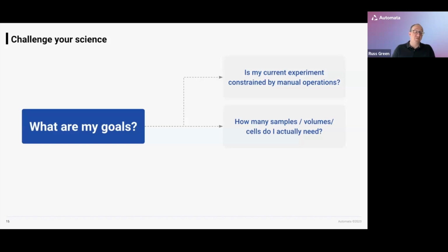In fact, I've seen this more than once, where we've gotten to the question about, okay, we're culturing cells in a certain size of flask. How many cells do we get from that? And the answer will be a couple of million cells. And then we'll get into the question about what we need in terms of numbers of cells to actually achieve the outcome. And it might be in the order of a couple hundred thousand, which of course then immediately challenges whether we needed that volume of cells in the first place. So we save on media, we save on processing time, and we also perhaps enable us to use the different kinds of labware that I'm going to come on to in a moment.